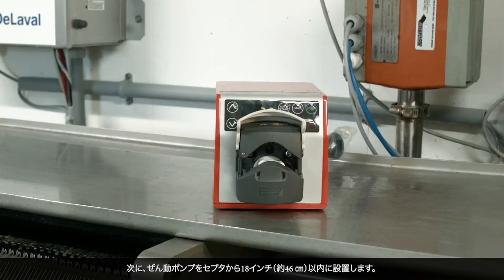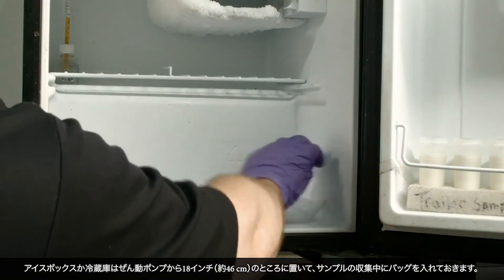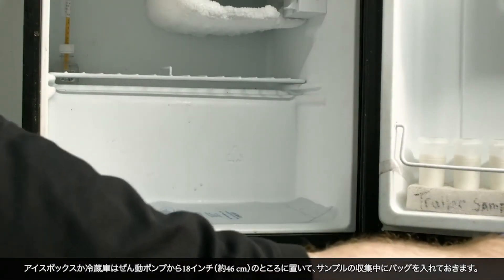Next, place the peristaltic pump within 18 inches of the septum. Place an ice chest or refrigerator 18 inches from the pump for the bag to rest in as it fills.